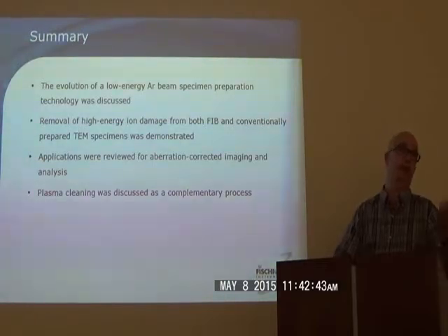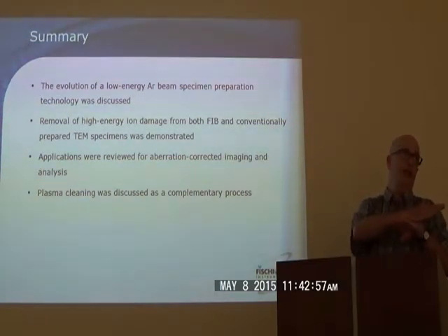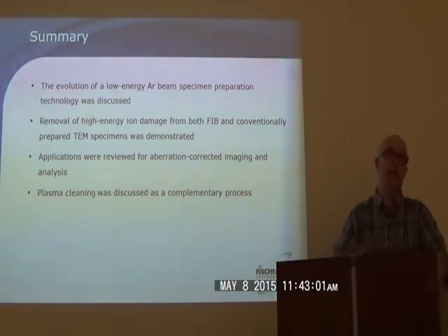Well, and of course, the other thing was we do have a smaller ion beam size with the Pico. There might be certain advantages going forward. And the holder is one of the advantages. We have a TEM holder with the Pico, so that the transfer to the TEM could be really rapid. If you could just take it out, you go right to the TEM, and that's one of the critical issues.